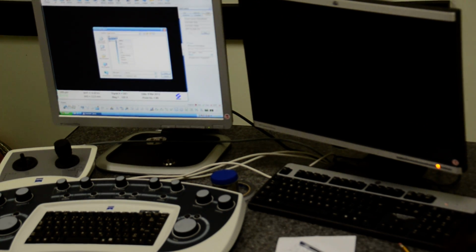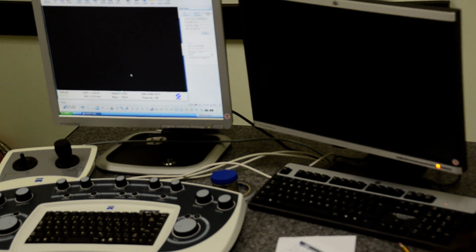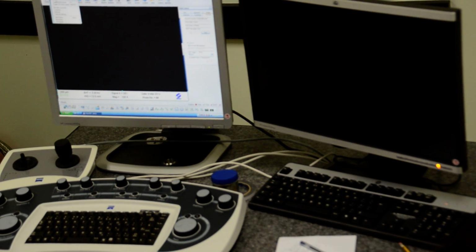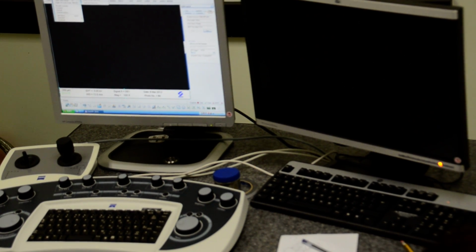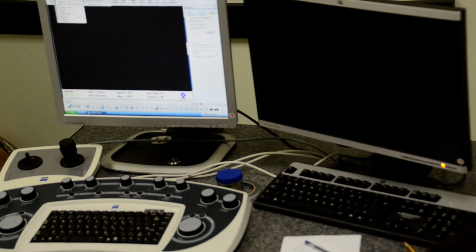We actually have two. Never mind, delete the one. So you save the one as a data zone. So next time, for example, you go here again, you view. There's something called data zone. Because just now you called it out. It says show the data zone.